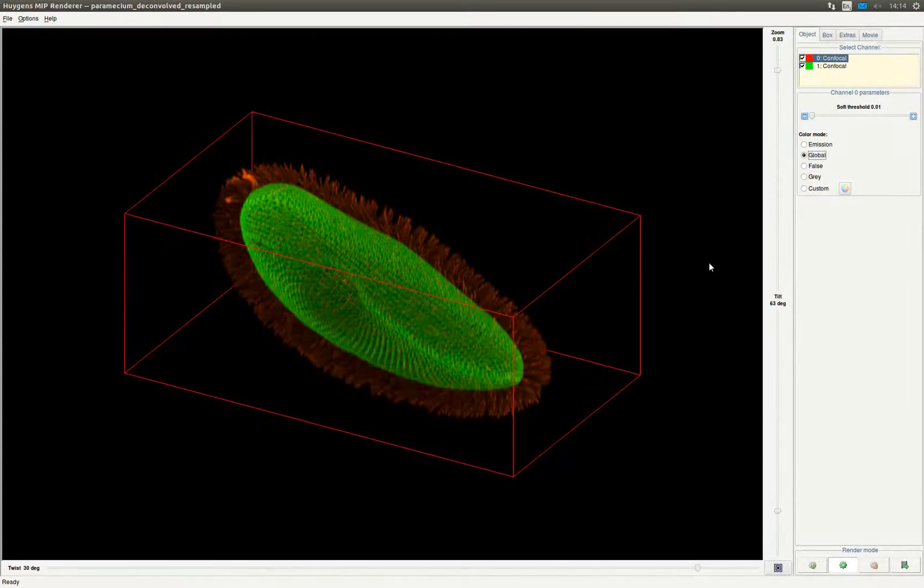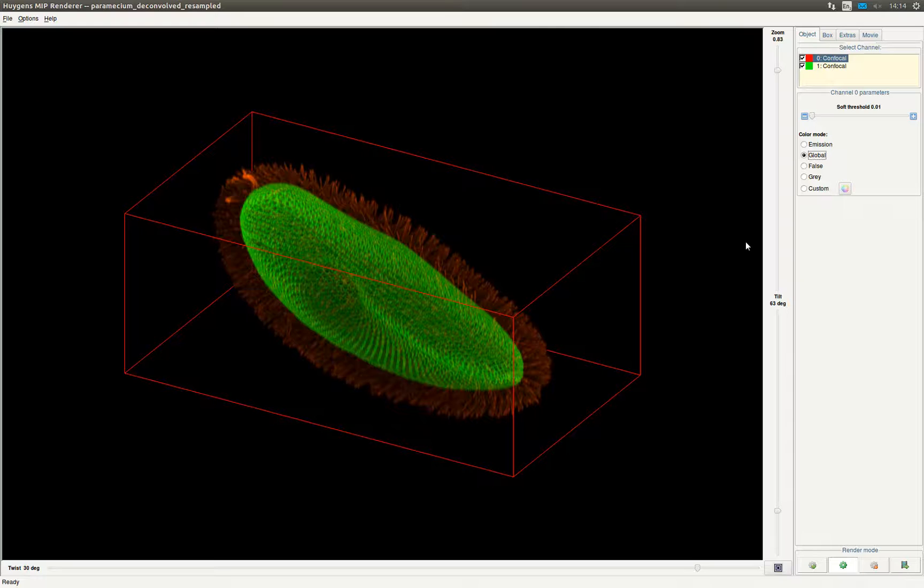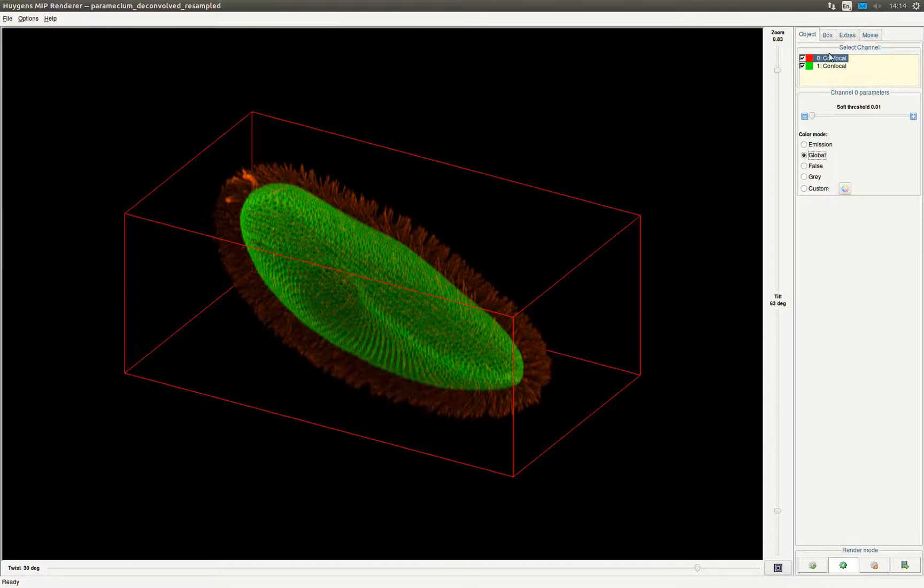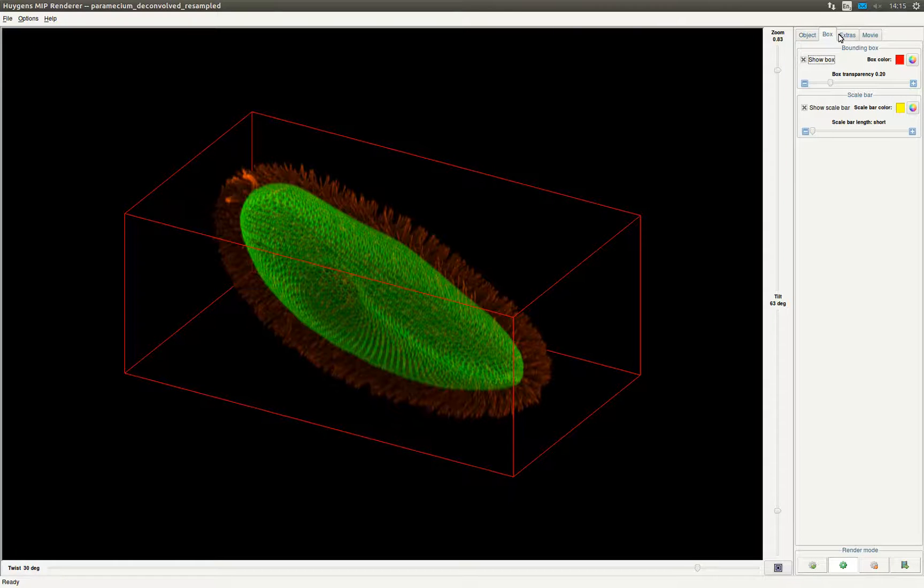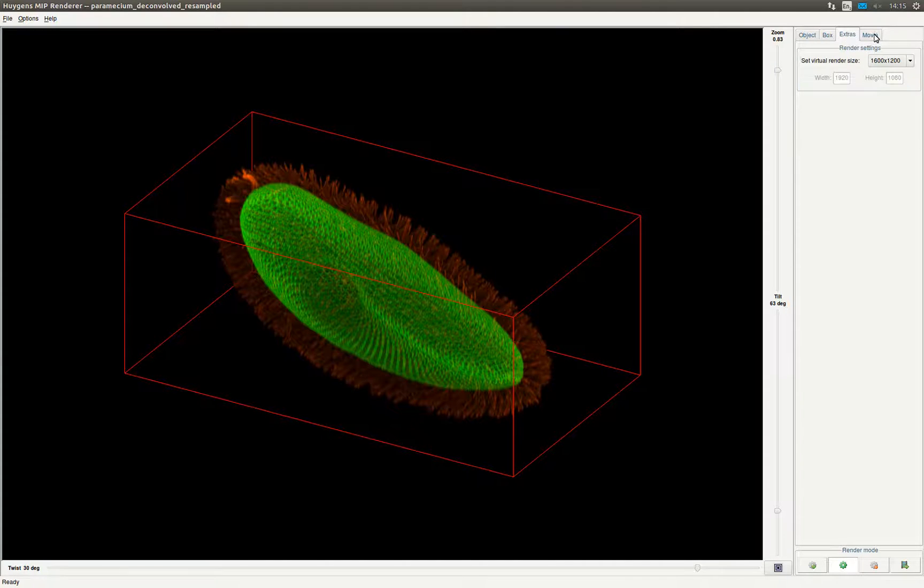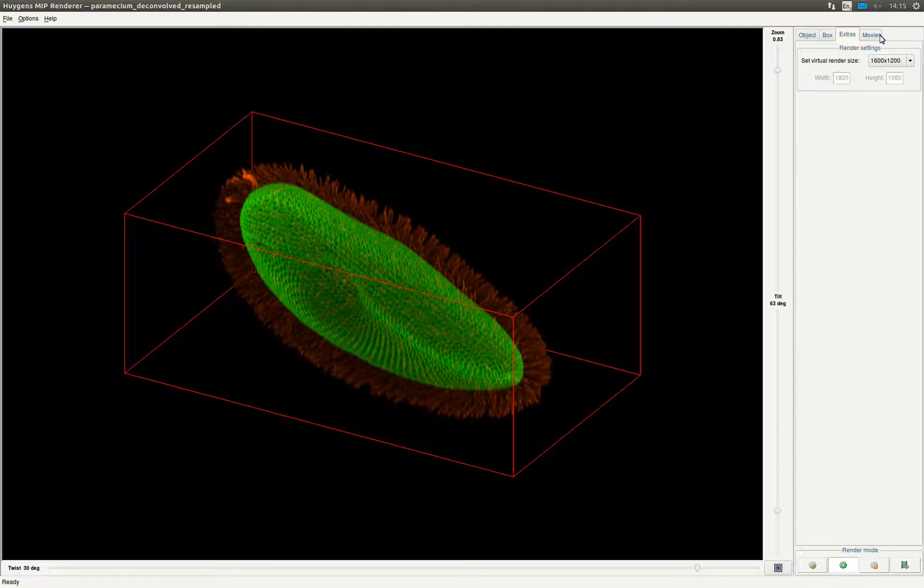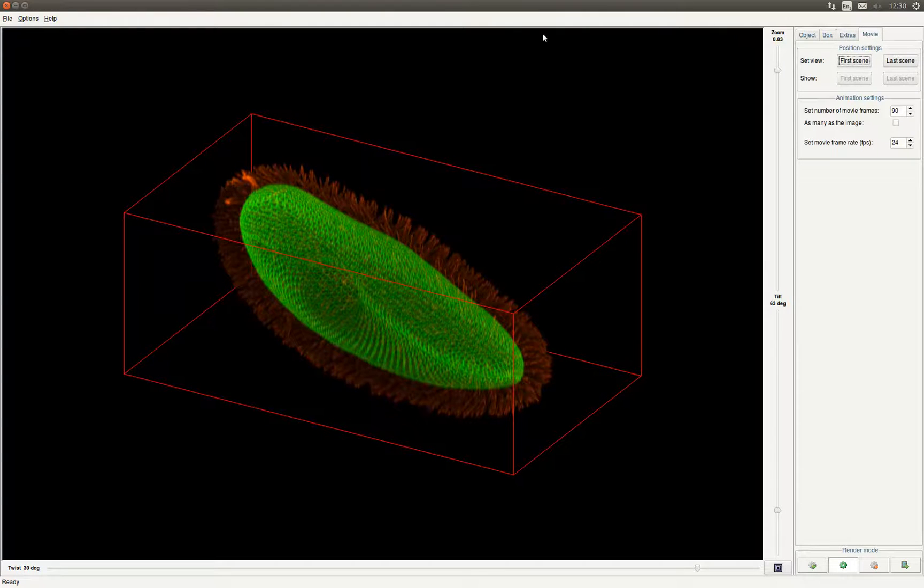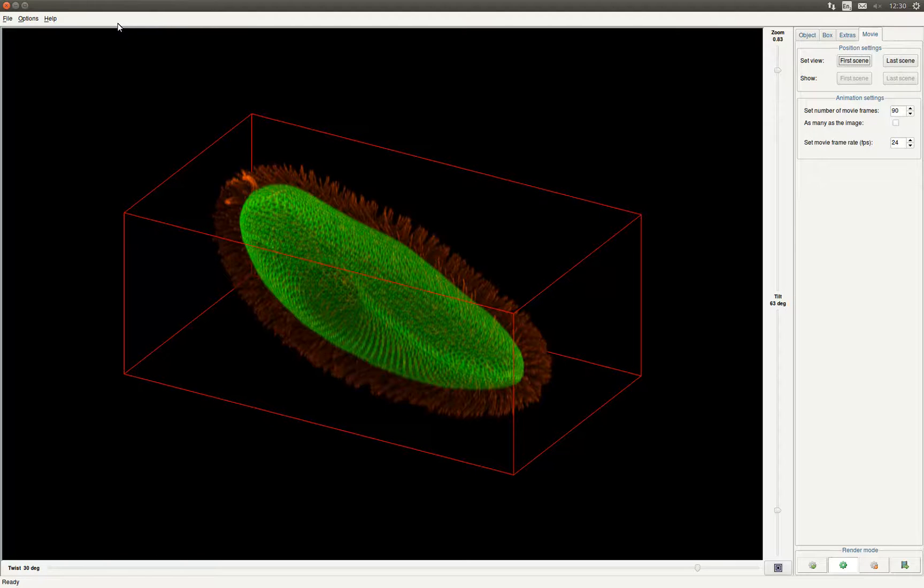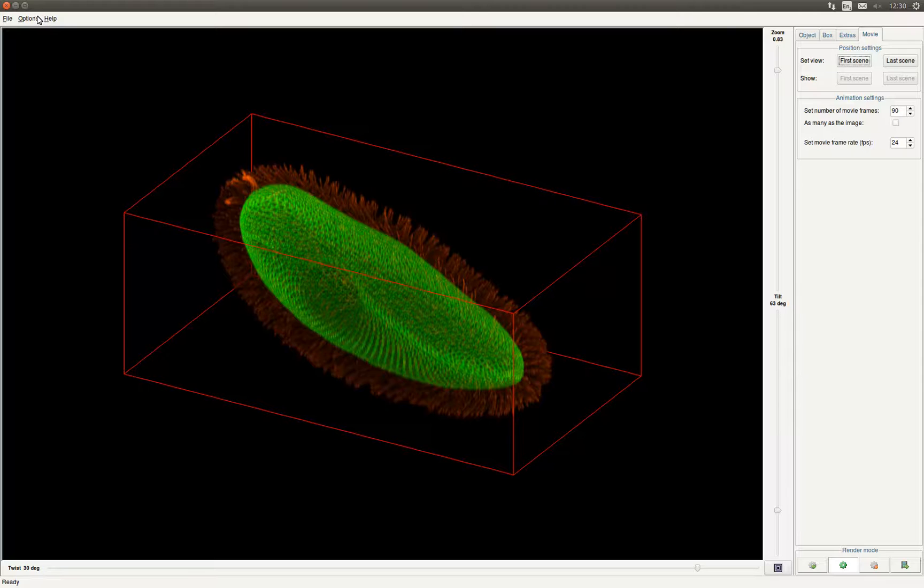In the object tab you can change the color of the object and select or deselect channels of interest. You can also change the soft threshold removing voxels with a lower intensity than the value of the threshold. The box tab can be used to change the box around the object. You can change the appearance of the box or completely disable it. In the extra tab you find the render size settings. And in case you would like to make an animation of the object you can set the first and last scene and find the movie settings under the movie tab. The button in the right bottom of the screen starts rendering the animation.